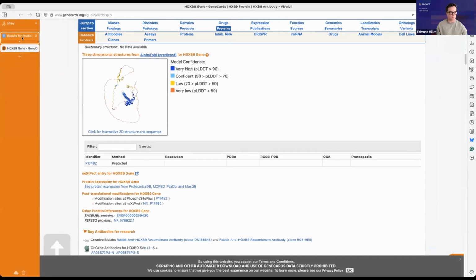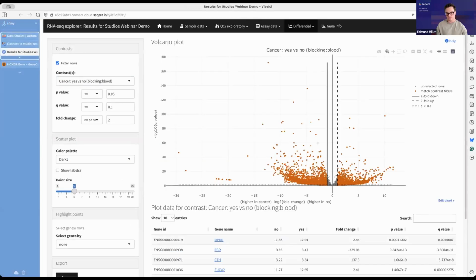Nice. And so that's a way that we have passed the data back and forth across the world, here in different time zones, and collaborated without the hassle of trying to explain how to install Docker and all these other various pieces. So I'm going to pass it back to Rob actually for some slides, and then we'll do a summary as well, and then launch into Q&A.